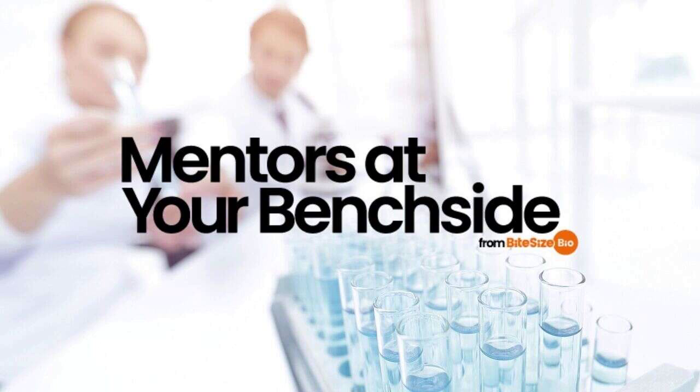Click on the name, and on the next screen you'll see a link to Pick Primers in the right-hand corner of the screen under Analyze the Sequence. Click on the Pick Primers link to take you to the Primer Blast tool. The Primer Blast tool has many parameters and options to set. Firstly, set the parameters for the qPCR primers. Here you'll find some of the basic settings for your primers, including the PCR product size and melting temperature. There is also an option to include sequences for reverse and forward primers.